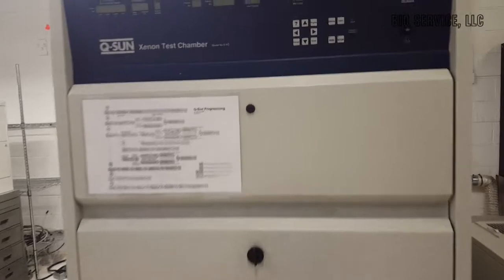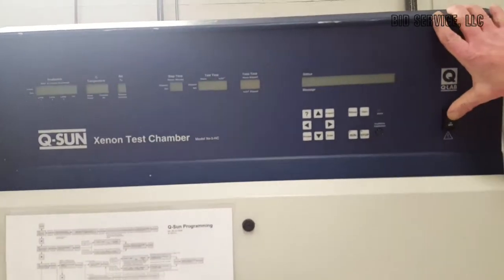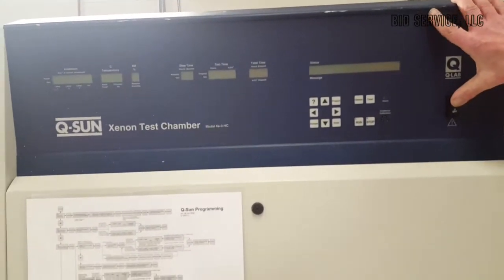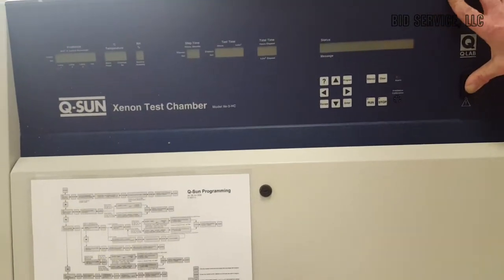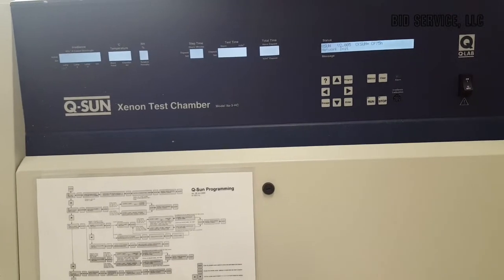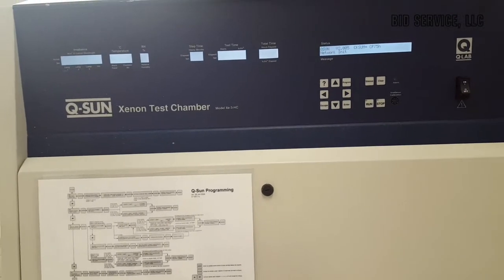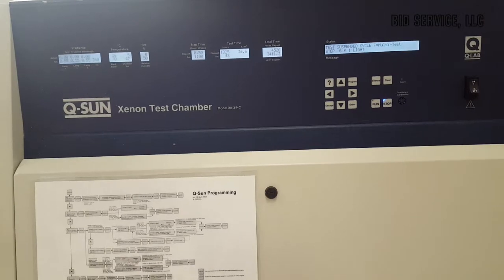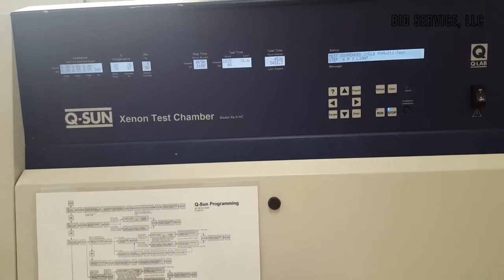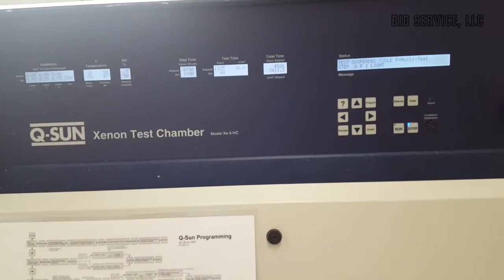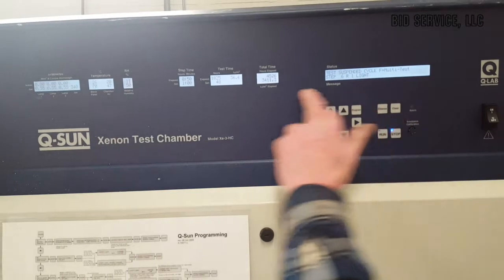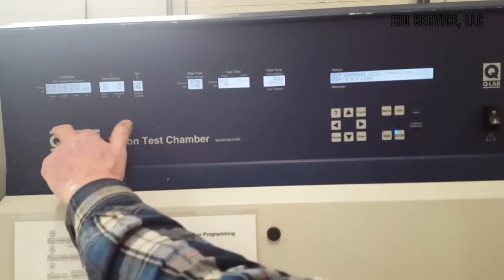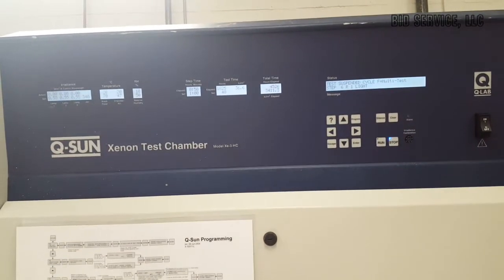First, we'll take a walk around it. We'll start by turning the switch on here. Now, when it first comes up, it'll normally stop at this first screen here, as you can see.